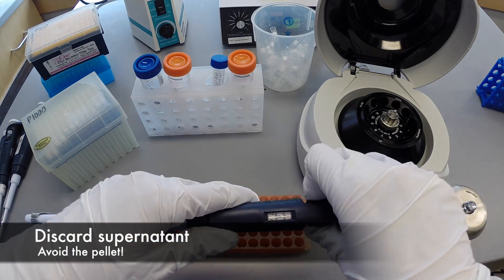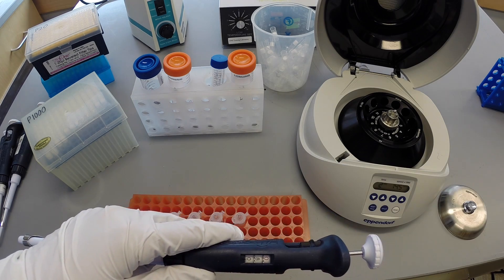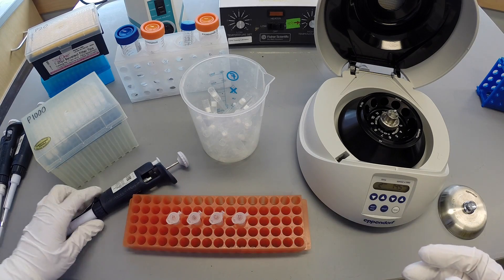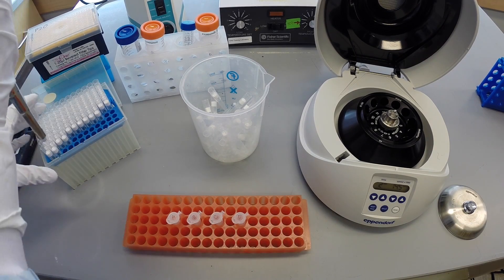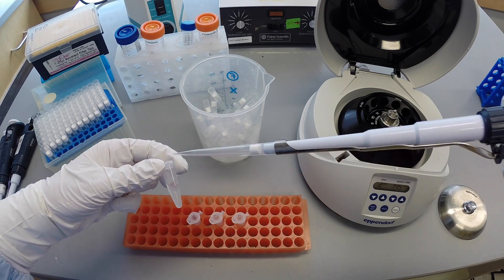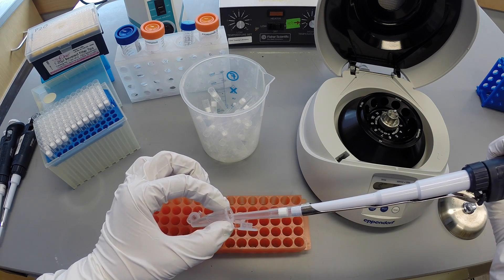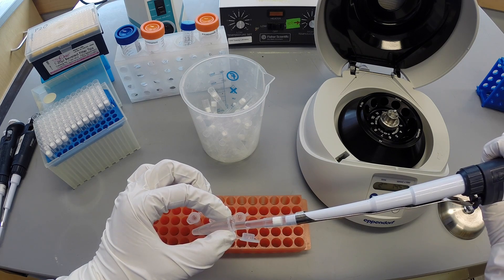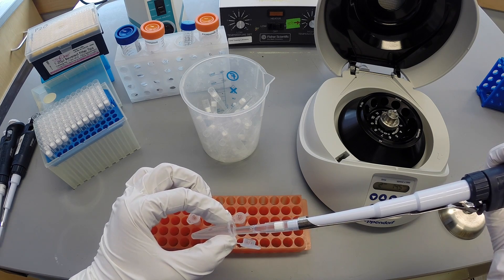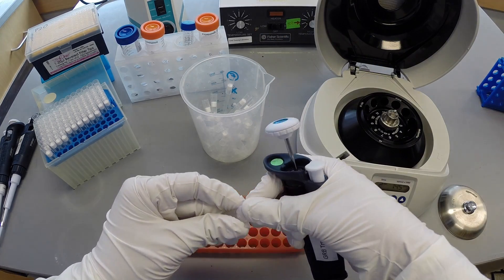Using a P1000, slowly remove and discard approximately 800 microliters of supernatant. Place the tip at the bottom of the tube on the opposite side of the pellet to avoid disturbing it. It is not important at this point that all solution is removed — just get as much as you can. Expel the tip with the solution inside into the discard bucket. Repeat this process for all remaining samples.